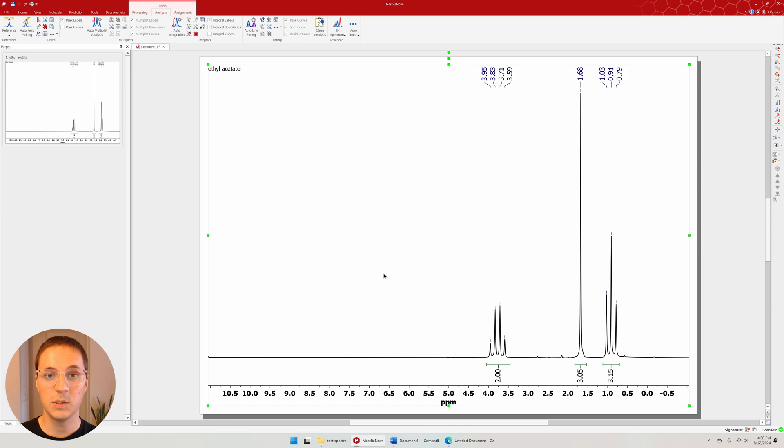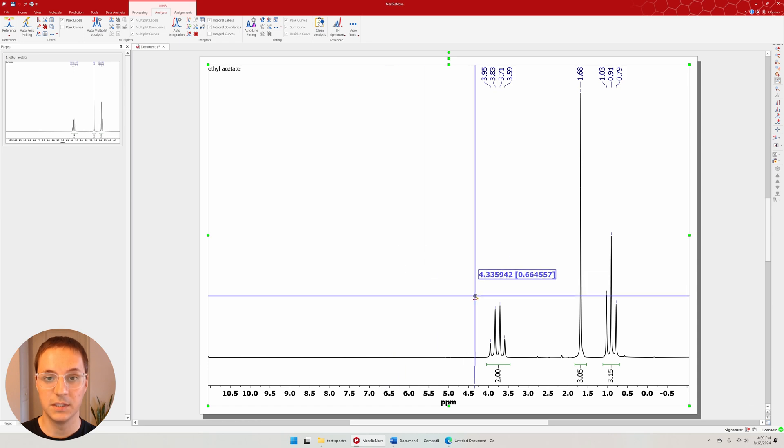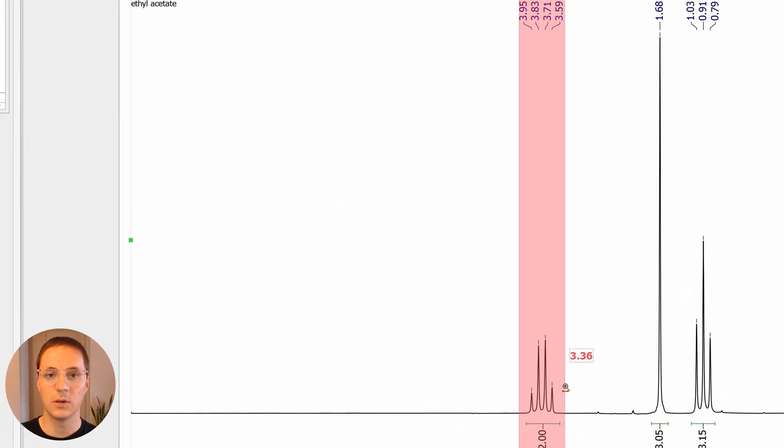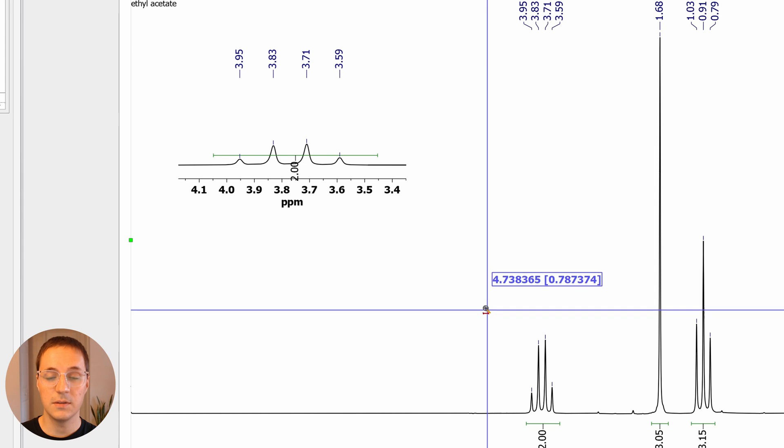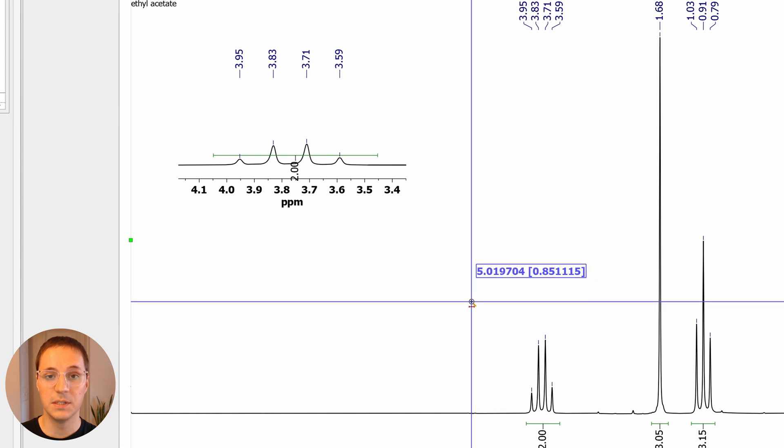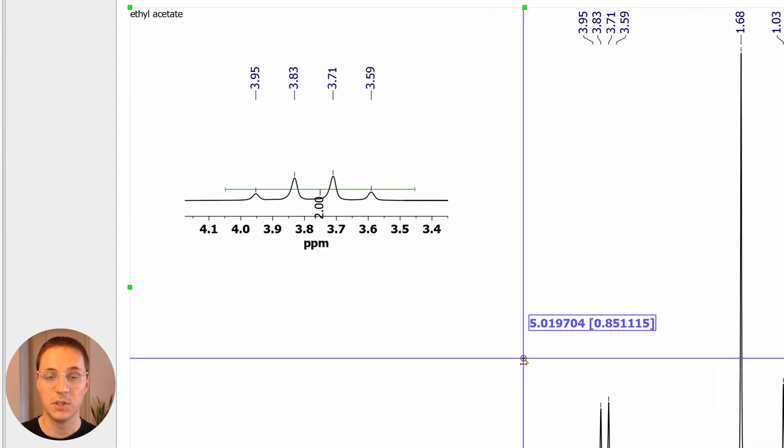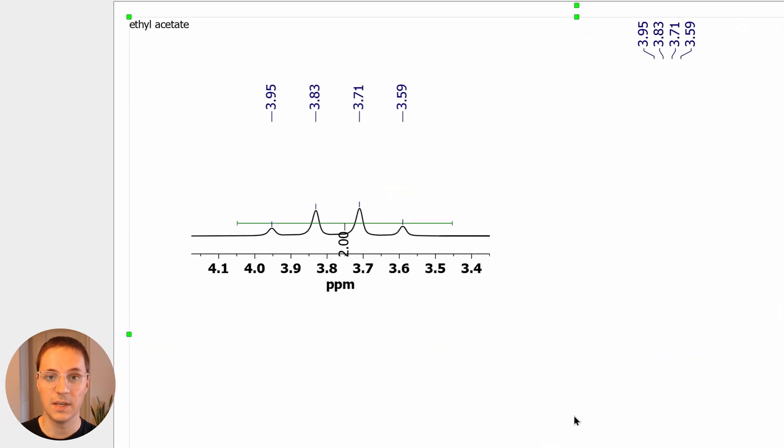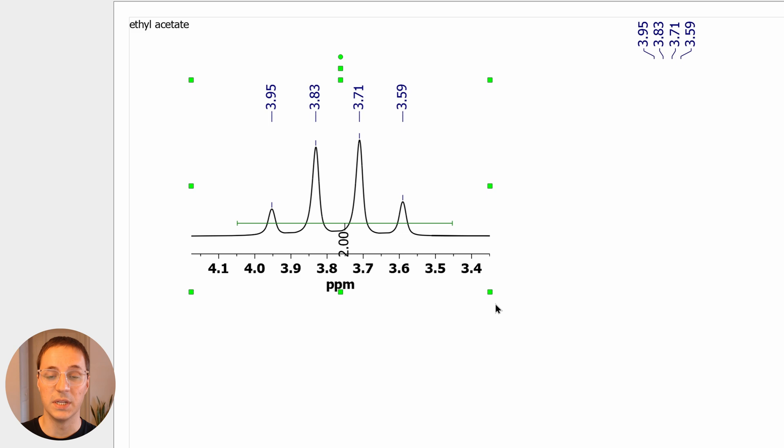You can also press E to enter the expansion tool. This opens up a zoom cursor, which allows you to select a region of the spectrum to show in an inset. This smaller spectrum can be adjusted individually.